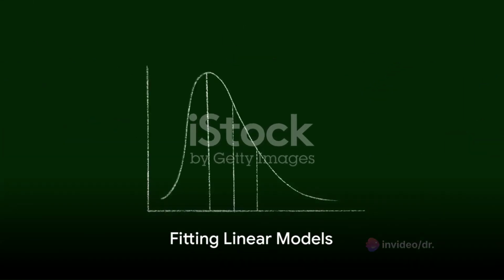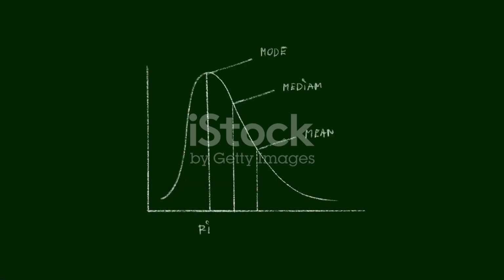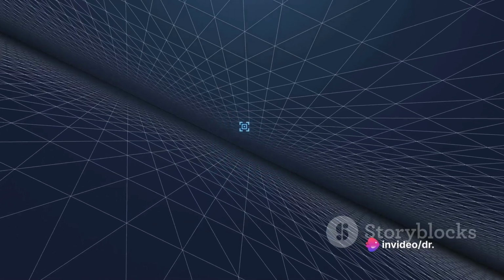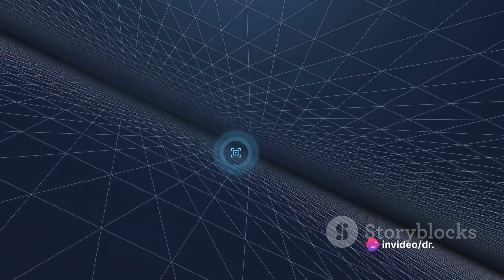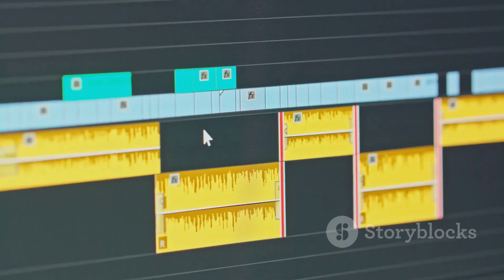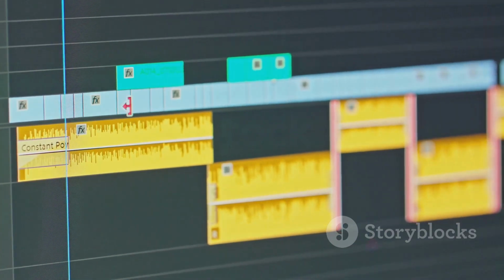But what if your data requires a more complex graph, like fitting linear and nonlinear adsorption, kinetic, and isotherm models? Origin Pro has got you covered. To fit a linear model, you need to use the Linear Fit tool. Navigate to the Analysis menu, select Fitting, then Linear Fit. Input your parameters and Origin Pro will draw the line of best fit for your data.